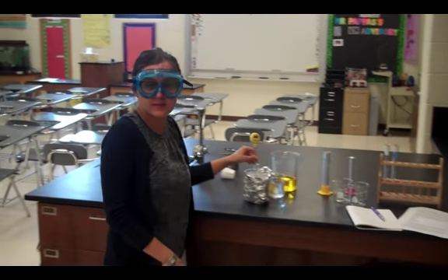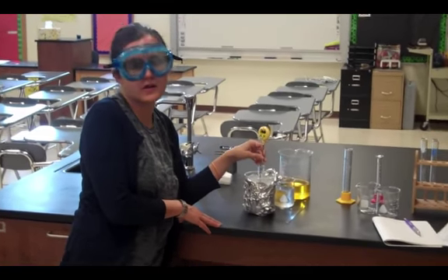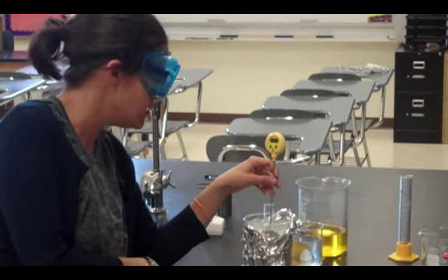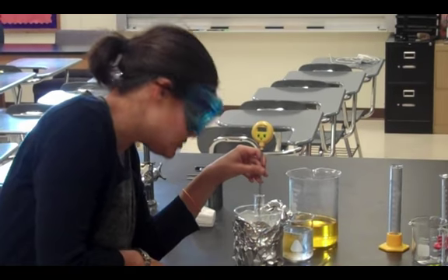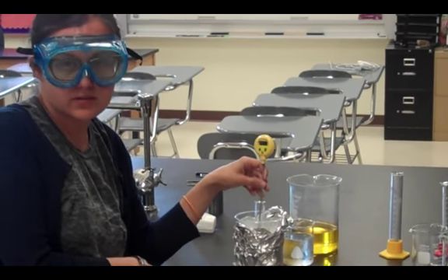So you're going to want to be observing your test tube to see when the first ice crystals form, then you know the water is freezing and we're at the freezing point. And once it's there, you're going to record at least 6 more temperatures after you first see ice crystals.